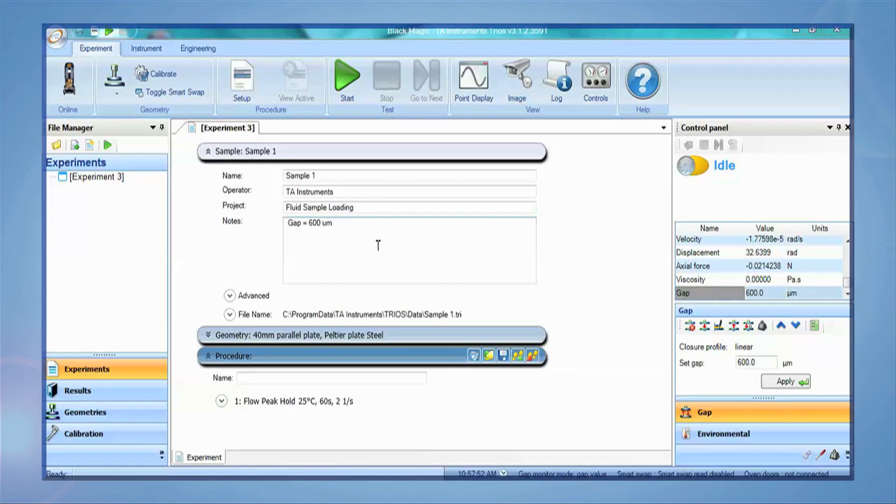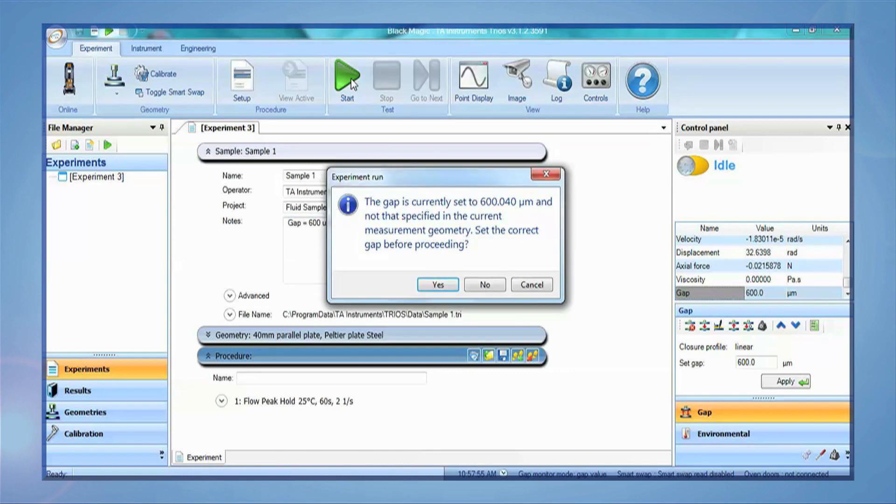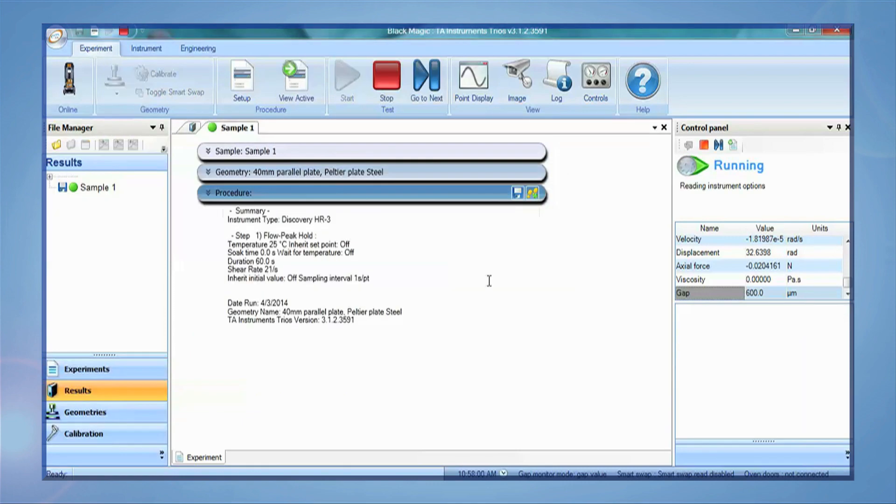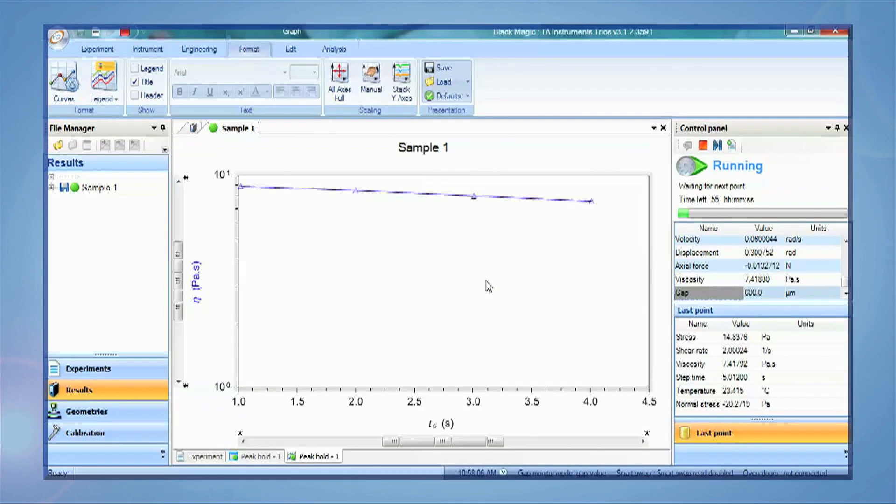The new gap will not match the operating gap value set in your geometry template. A prompt message will appear at the start of a test. By clicking no the new revised gap will be utilized therefore the equations will be correct.